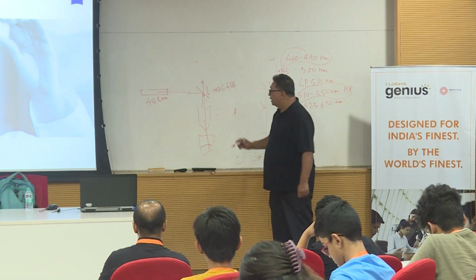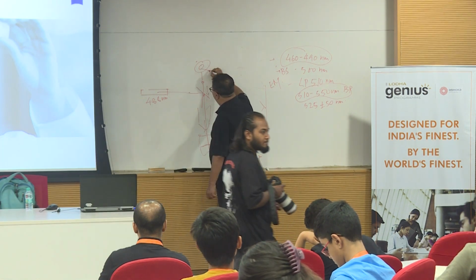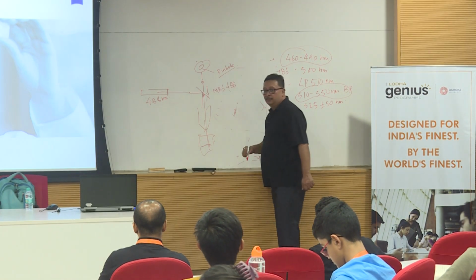Now in the emission side, you have a magical wheel, what we call as a pinhole. A pinhole.